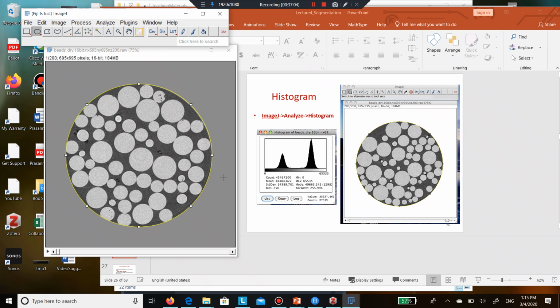All right. And for some reason, my background is set to this beautiful shade of gray, which is the default value somewhere in ImageJ that I'm not going to track down now. But we can see the value is 35113, which seems to be right in between this and that, which can be problematic in various ways, but I'm going to leave it be for now.